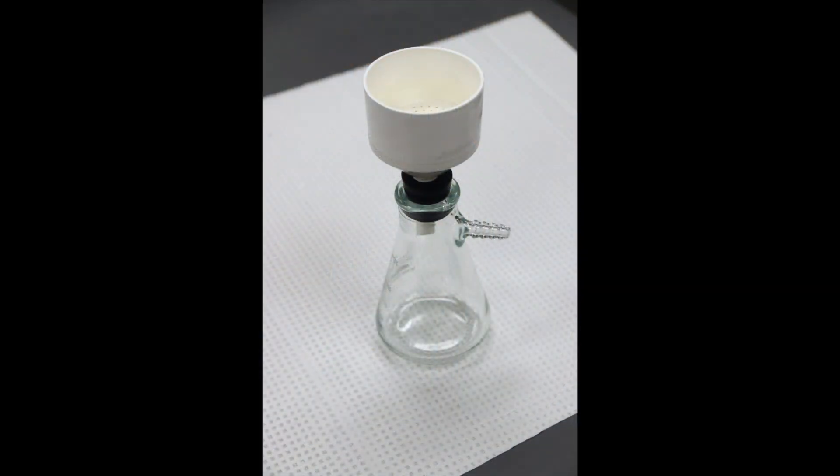Next, you'll need a Buechner funnel. These come in a variety of sizes and types, but the ones we use in the lab most often are these plastic ones.